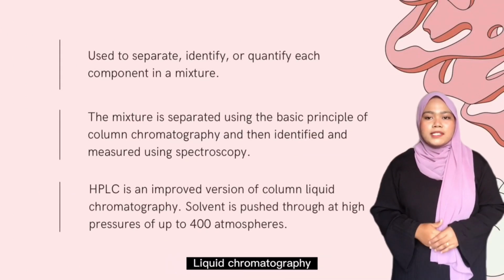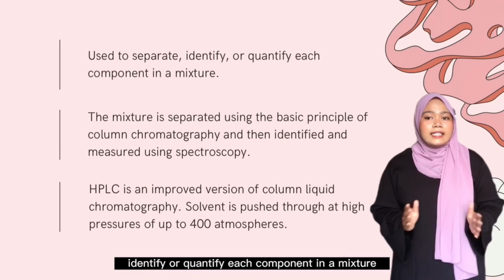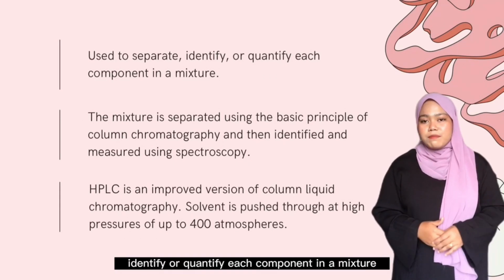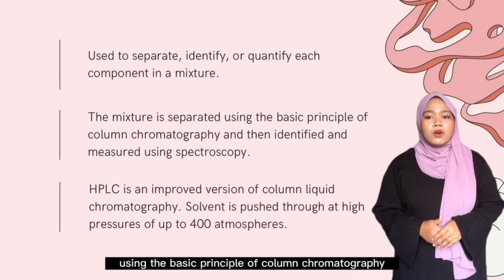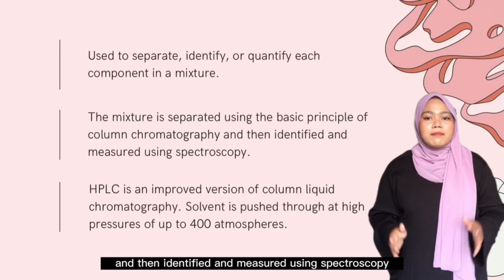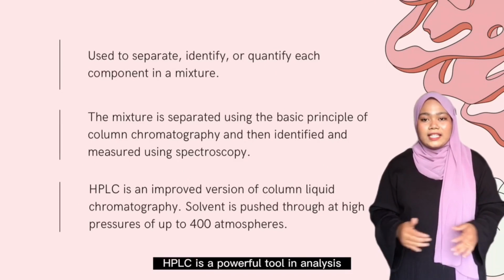HPLC or high performance liquid chromatography is an analytical technique that is used to separate, identify or quantify each component in a mixture. The mixture is separated using the basic principle of column chromatography and then identified and measured using spectroscopy. HPLC is a powerful tool in analysis.